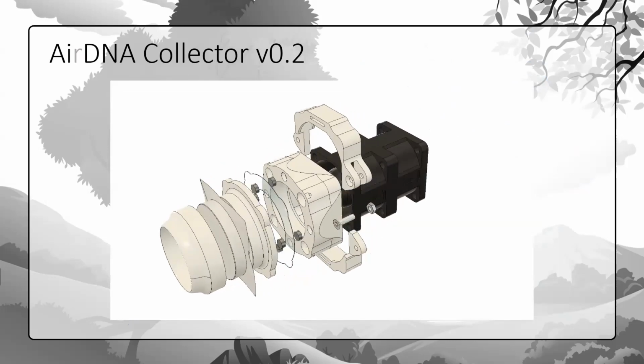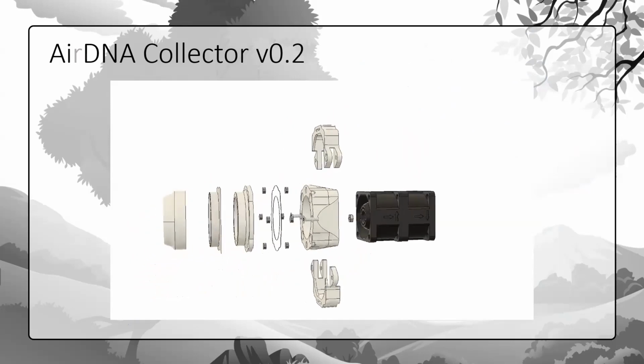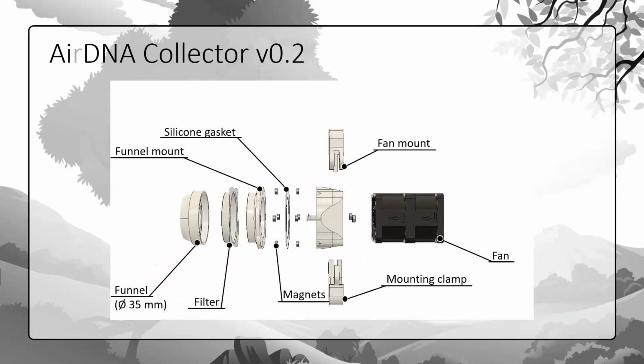As you can see, most of these elements are 3D printed, so it's more or less easy to rebuild this entire device. For a non-institutional researcher, you just have to find a 3D printer or any company shop that does this. So every part is more or less in the center area, except, as you can guess, probably the fan. That is the major motor driver that basically gives the entire principle. This is the most expensive part.